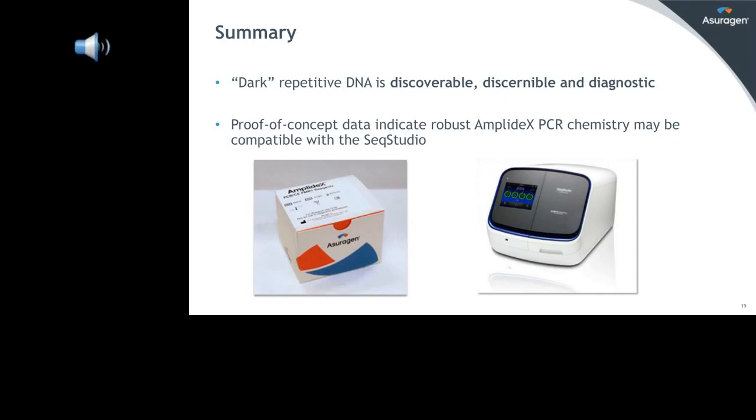Yeah, so I alluded to this a little bit in the previous answer, but the nice thing about this approach is that unlike NGS, this is a very straightforward methodology. Take your purified genomic DNA sample. We've had experience with lots of different sample types just in general using this assay approach, from buccal cells to whole blood to urine to other sample types. And we can take that DNA, you put it into the PCR.